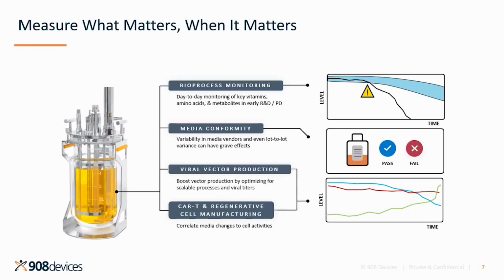Before the start of a process, one can sample the fresh media to ensure that it was mixed and formulated correctly. This analysis extends to ensuring consistency of the fresh media to rule out any lot-to-lot and vendor-to-vendor variations.